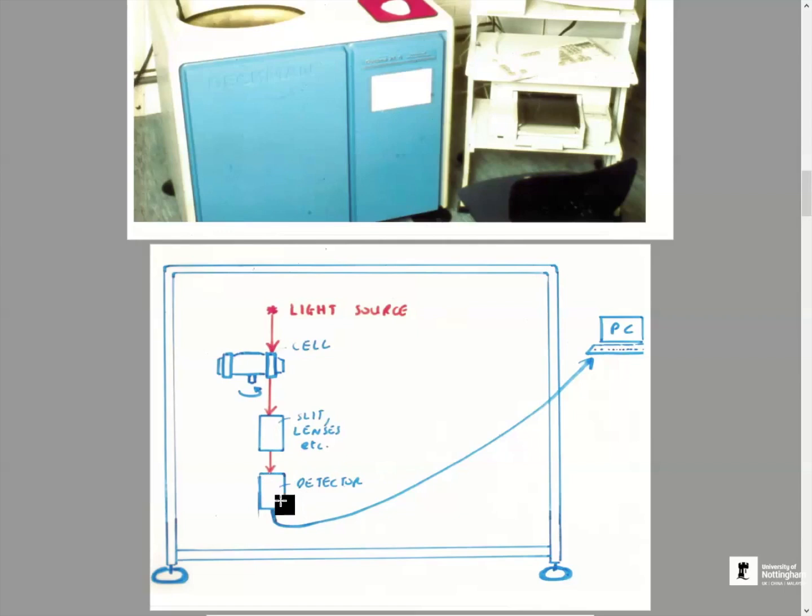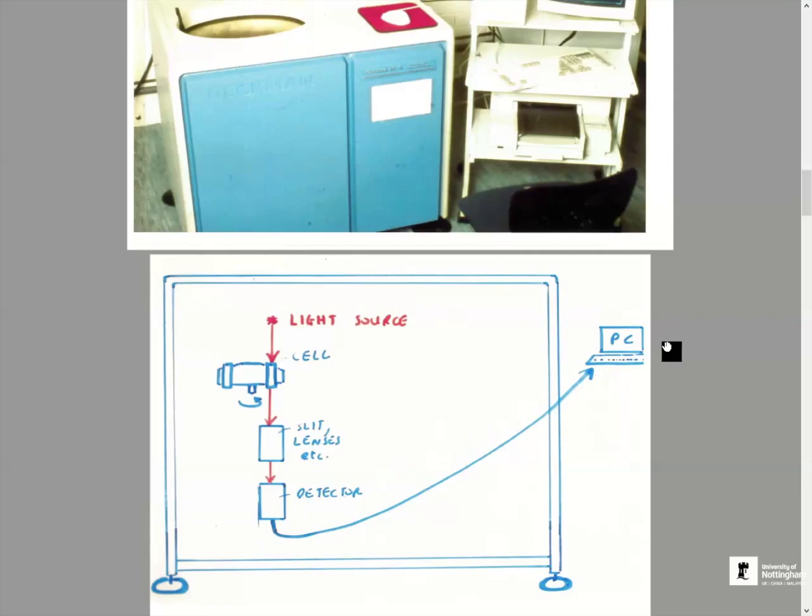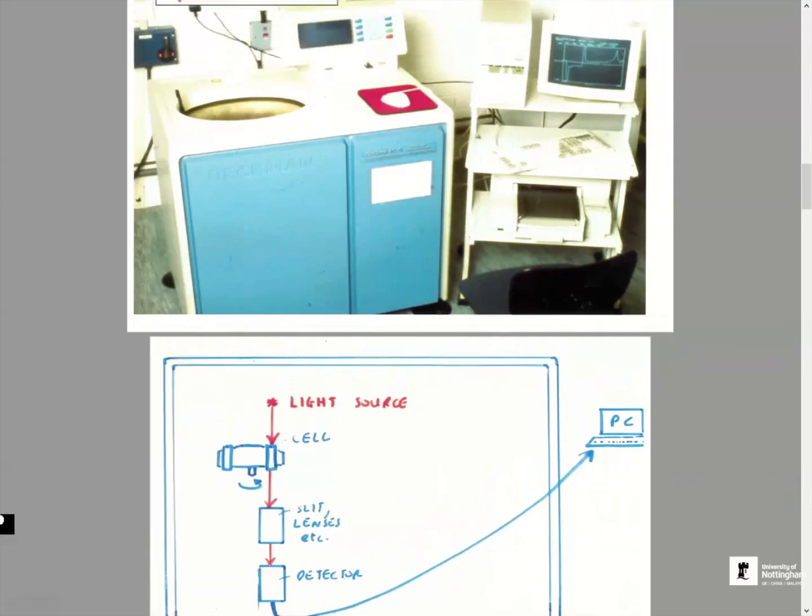If it's refractive index optics, it's some sort of CCD camera which detects the pattern, and the information is then sent through to a computer for analysis. So that's what's going on inside here. Obviously it's more complicated than that. I haven't shown all the refrigeration, vacuum devices and the optics, but that's the basic principle, and the data goes to the computer.